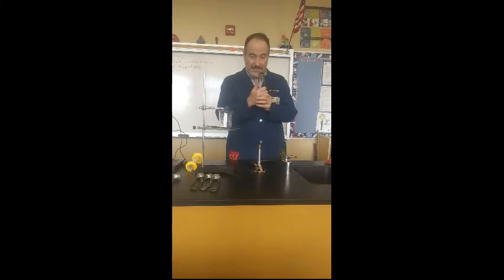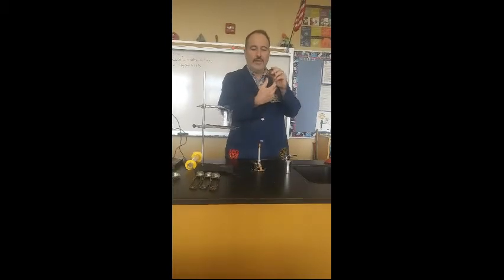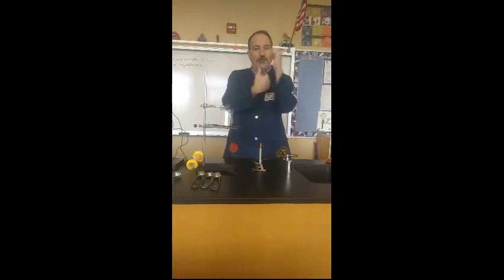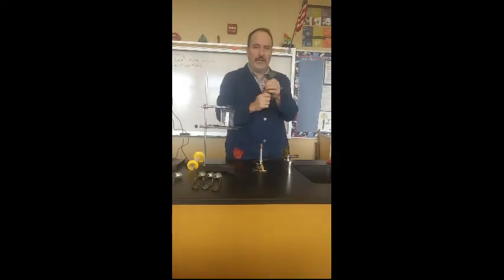Now the trick to these is, if you just push sideways, you may or may not get a spark, probably not. You have to apply a force this way. You want to take that flint and strike it hard against the file.